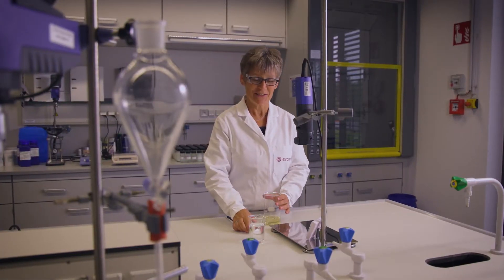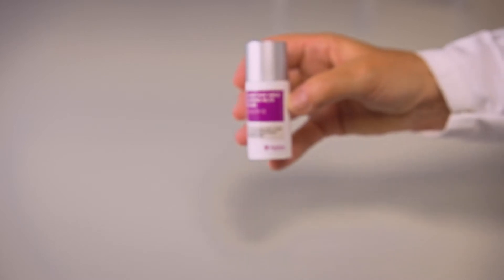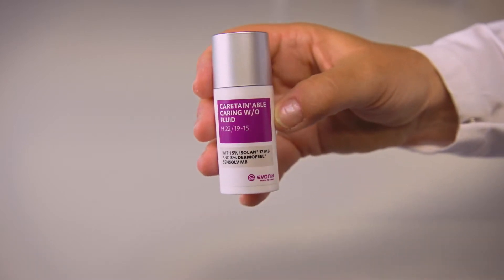Welcome to our lab. My name is Sebastian Beckers. I'm a technical manager here at Evonik Industries, and today I'm here with Barbara Hohnberg, one of our experts in the development of cosmetic formulations. Today she will prepare with us the Caretain Able caring water-in-oil fluid.